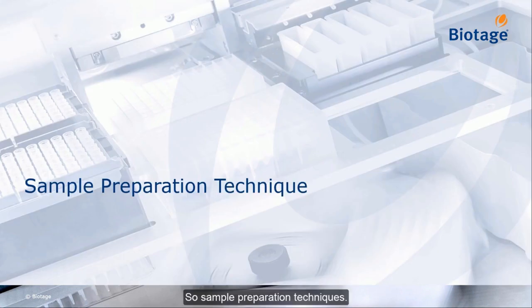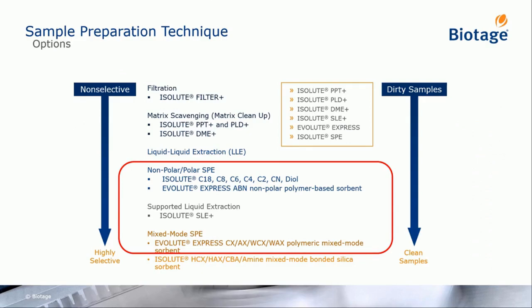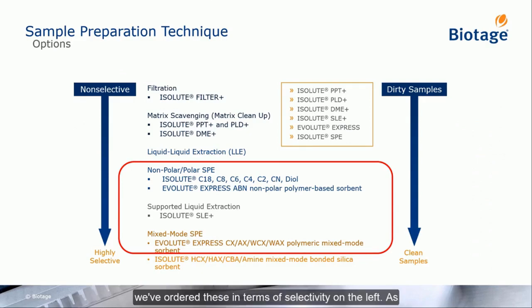So sample preparation techniques. You've obviously got a toolbox. So here we've ordered these in terms of selectivity on the left. As the selectivity increases on the right, extract cleanliness.